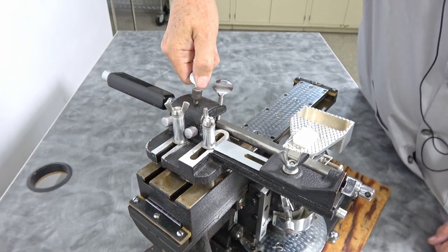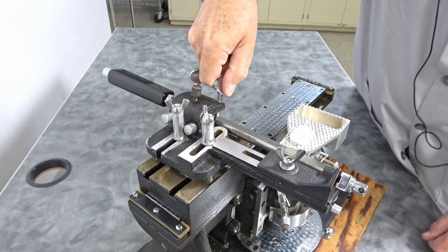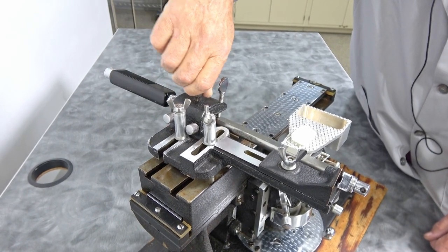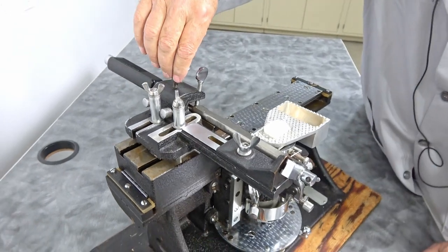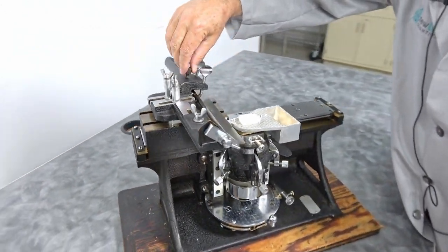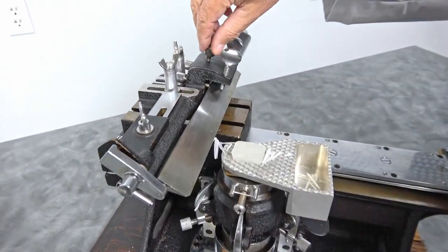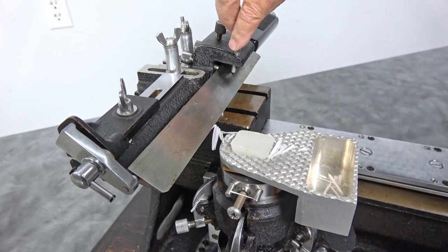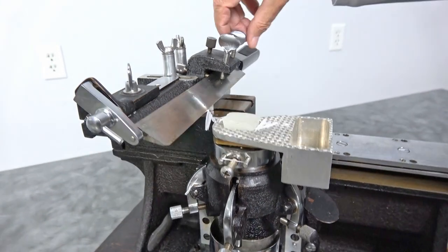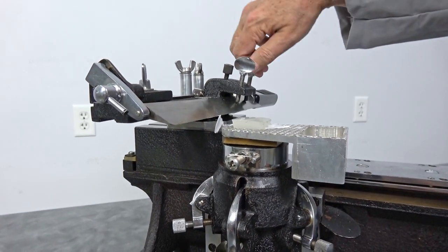We can change the angle of attack on the knife by using this knob here. It'll change your blade angle up and down. You can see it there, it is a balancing act because as you do something with one you have to counter it with something else.